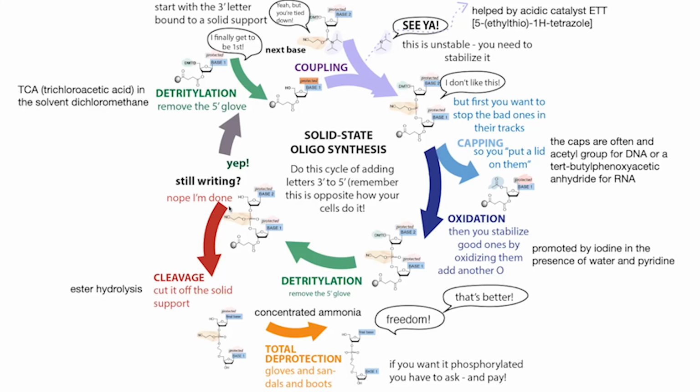extra steps to finish things off, because there's a bunch of things that are weird about this molecule. It's got a bunch of protective groups, such as on these bases. It's got these weird bonds, so we don't have these phosphodiester bonds like normal. We have these weird things sticking off of them to protect them. So we need to deprotect all of these things in order to make our sequence like normal.